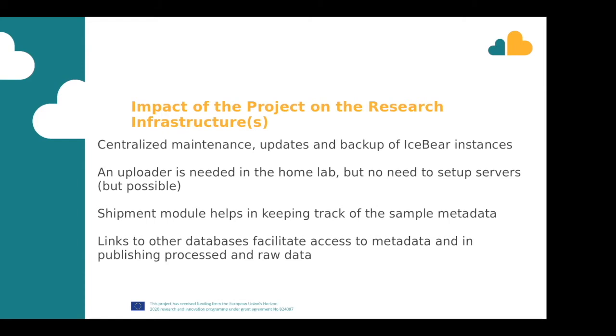And the shipment module, of course, helps tracking the sample metadata, and we also have links possible to raw data and metadata and publishing process data. We link to PDB and Proteopedia and so on, to these sorts of resources from IceBear.